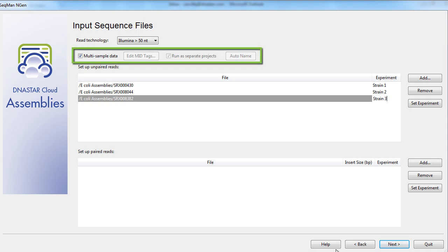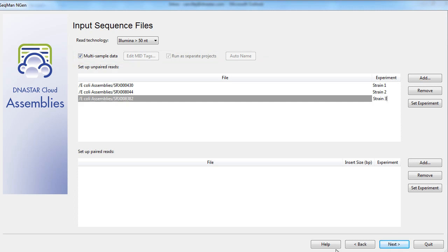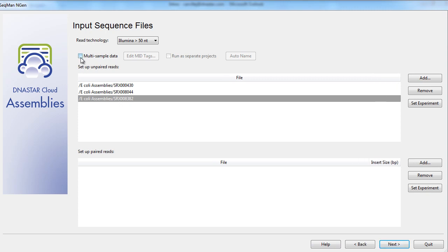We will also want to pay attention to the parameters at the top of the screen before moving ahead. Currently, we have checked the multi-sample data box, which in turn selects the Run as Separate Projects box. This ensures that each of our experiments generates a separate assembly project. If we choose to uncheck this box, then this creates a single combined assembly.